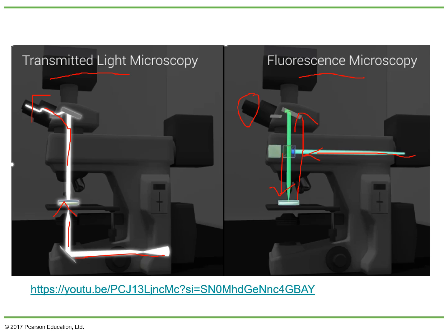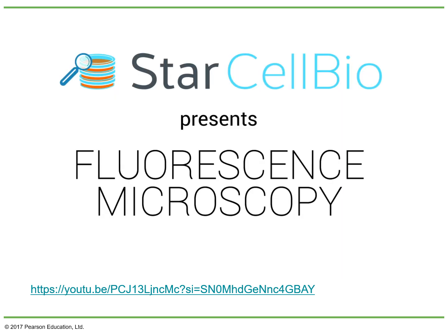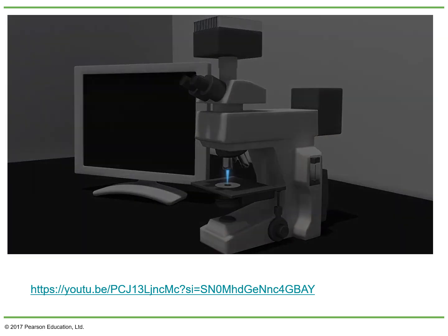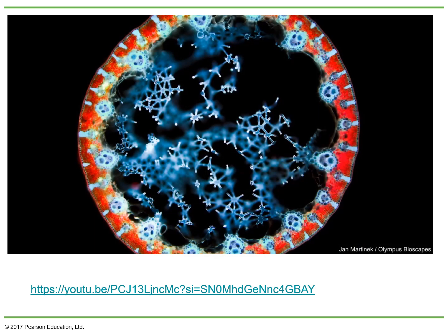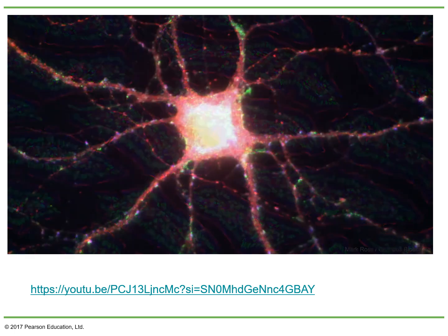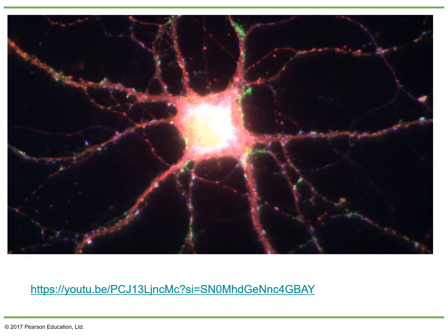be in the lab. In this animation, we will introduce you to fluorescence microscopy. Fluorescence microscopy is a special type of light microscopy in which the microscope uses a laser as the light source. A researcher will require the use of a fluorescent microscope to visualize autofluorescent cellular structures, fluorescent dyes or stains, or to analyze the expression, modification, and/or localization of proteins using fluorescent antibodies by a technique called immunofluorescence.